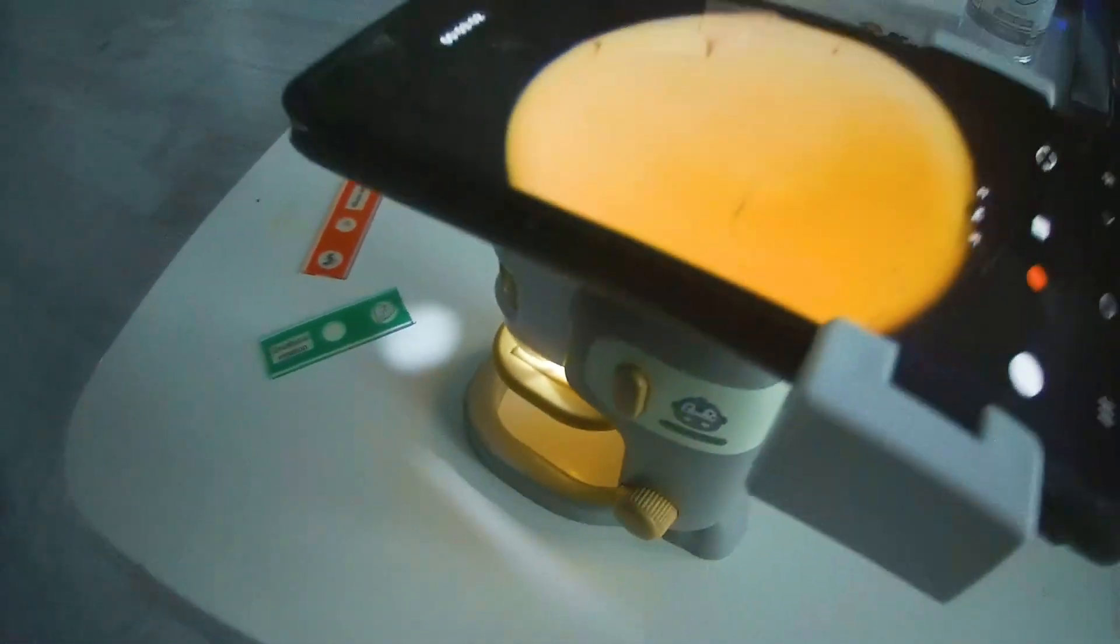This part does adjust as well, so you can go closer or further away from the subject. There is a light here, but for that, you're going to need to install batteries. There's your focus as well, right over here, and then you have two separate adjustments up here and over here. So let's go and install batteries.